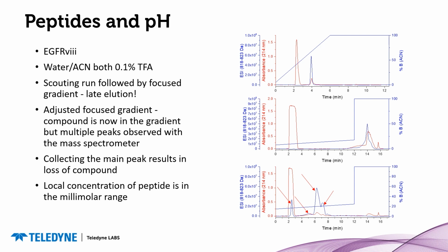So the concentration within the peak is closer to about 2 millimolar and is about 1/3 the concentration of the modifier, enough to deplete the slight buffering capacity of TFA. The extra peaks represent lost compound if the peptide was purified only with UV detection. Analytical HPLC injections contain so little material that the TFA can control the ionization and the pH is not affected.